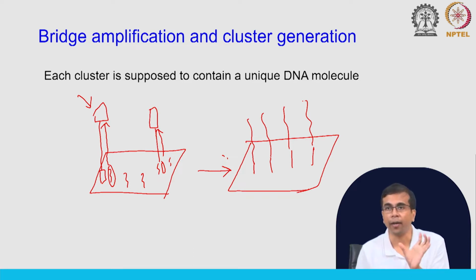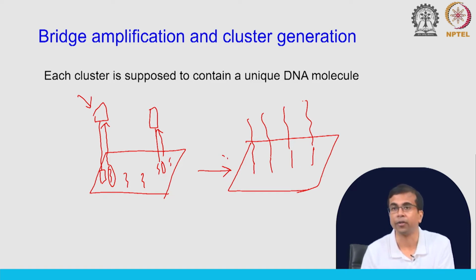If you have clonal molecules, the complementary strands to those molecules will be synthesized at the same time, because they contain the same sequence, and that comes as the signal from that well in 454. Similarly, in Illumina, you need to generate these clonal molecules, which we call clusters. How do you generate these clusters? We do this by a process called bridge amplification.